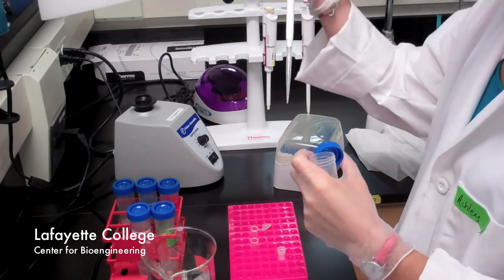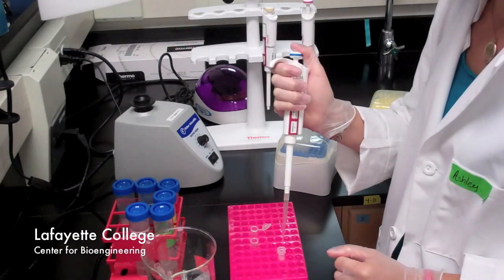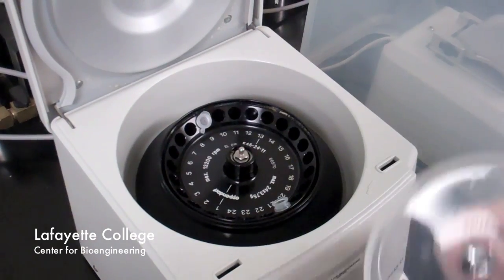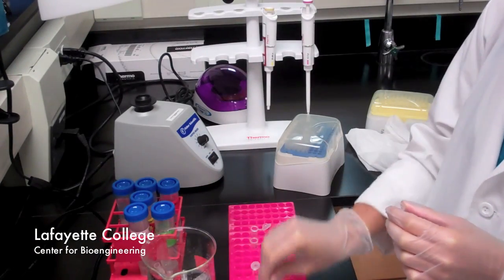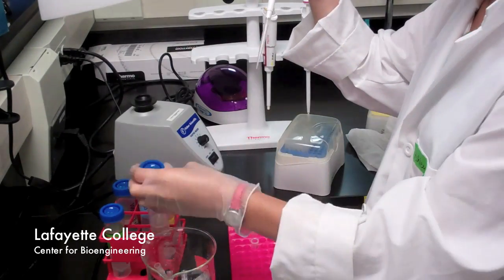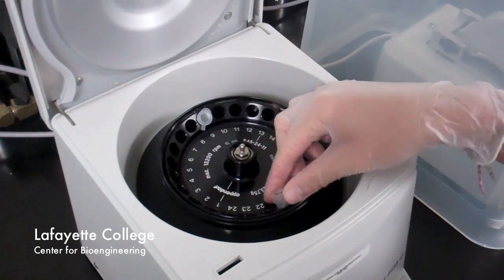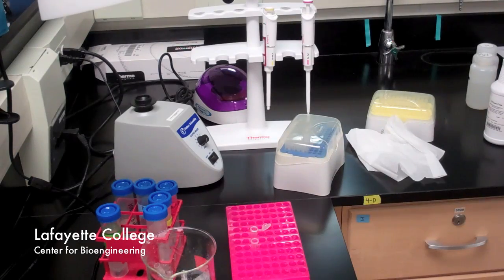Add 700 microliters of buffer RW1 to the spin column. Centrifuge for 30 seconds at 10,000 RPM and discard the flow-through as previously shown. Now add 500 microliters of buffer RPE to the column. Again, centrifuge for 30 seconds at 10,000 RPM and discard the flow-through.